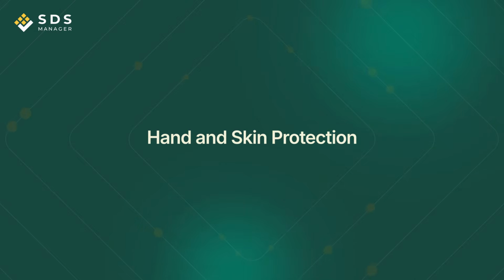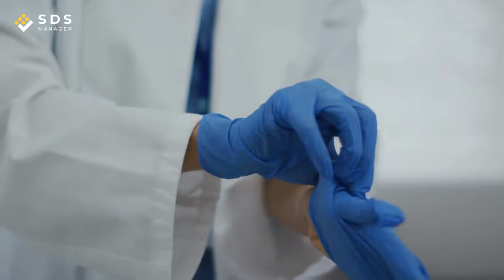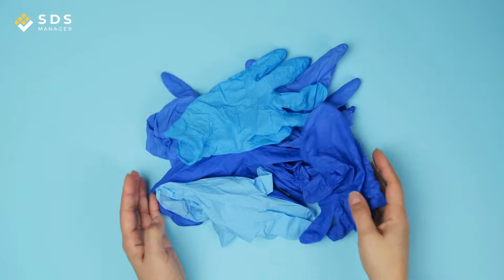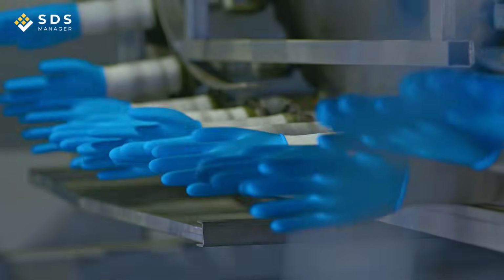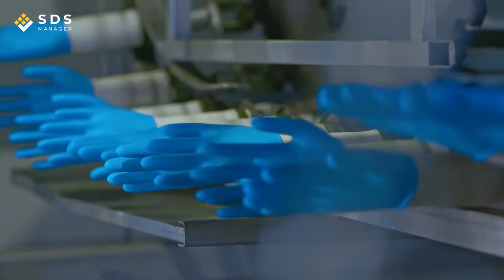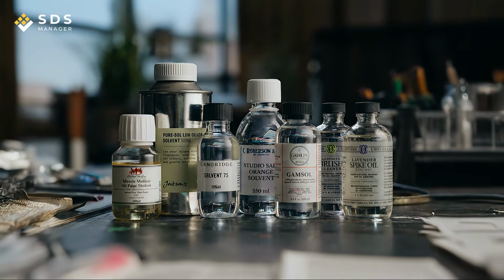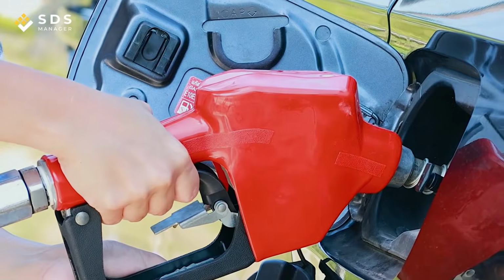Hand and skin protection. Gloves are the most commonly used form of chemical PPE and also the most commonly misused. The material of the glove determines which substances it can resist and for how long. Nitrile gloves offer broad resistance and are suitable for many solvents, oils, and mild acids. Neoprene gloves cover a wider range, including some acids, bases, and fuels.